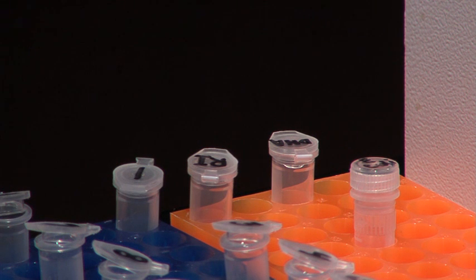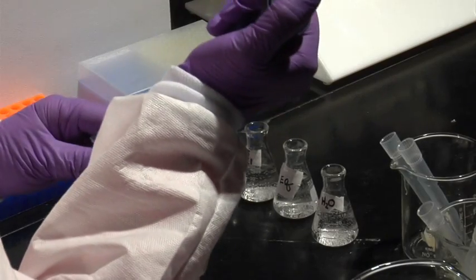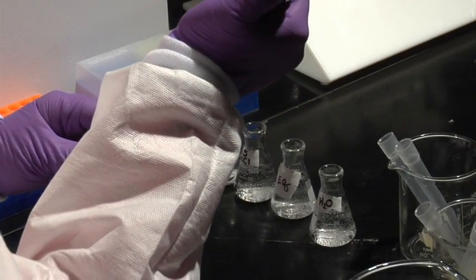Label nine micro test tubes, one through eight, and one control tube. Pipet 30 microliters of qualified water into each tube. Add five microliters of buffer and five microliters of DNA.